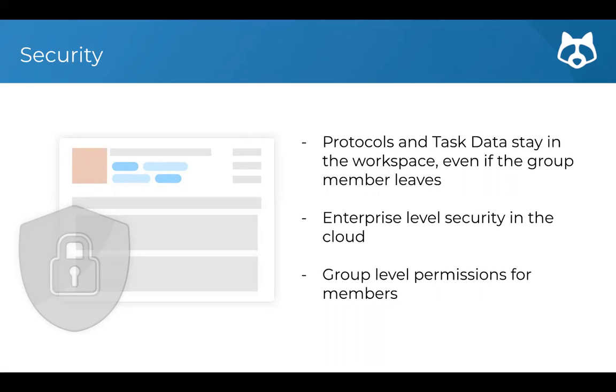And there's group level permissions for members, so you know that the tasks that you're working on are dedicated to that group, and if you are part of other groups, they won't be able to see what you're working on, what your tasks are, or anything like that. Just an important thing to note.